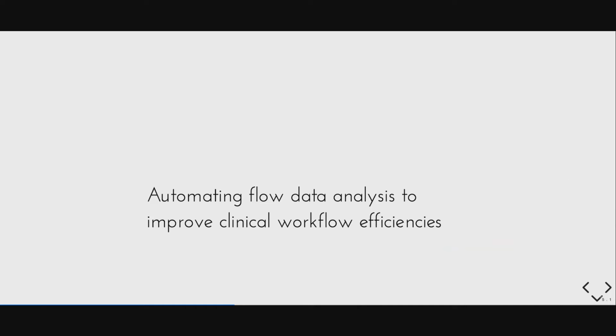So having understood the flow cytometry data and some commonly used analysis modules, I now want to share how we use this automation and AI to improve the efficiency of the lab workflow.